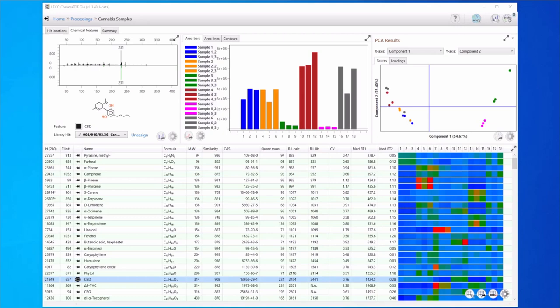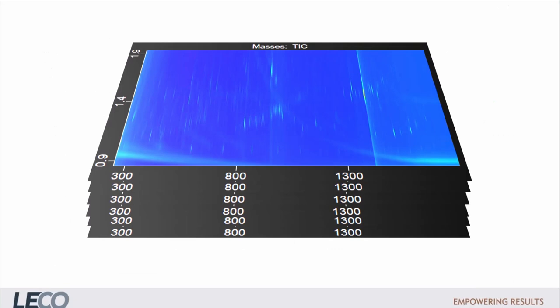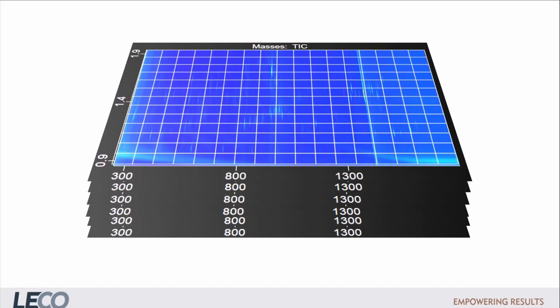Tile helped us focus on the regions of the chromatogram with differences, so that we could efficiently get to this type of information about the samples. It does this by connecting and comparing the data with a chromatographic tiling approach, where grids of retention windows are used for the comparison calculation.